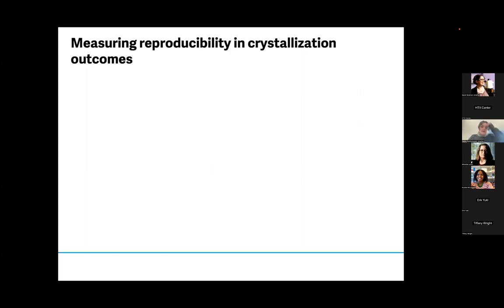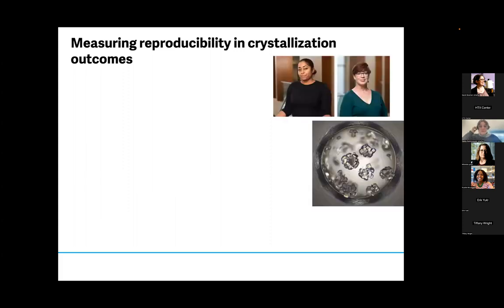So the next thing I want to talk about is just a quality control measure that we've recently implemented that I'm pretty proud of in our screening center. And I want to shout out Tiffany Wright and Elizabeth Snell as they're responsible for a lot of this work.